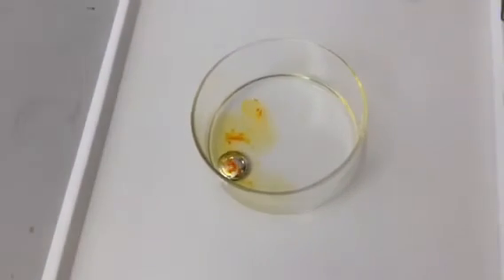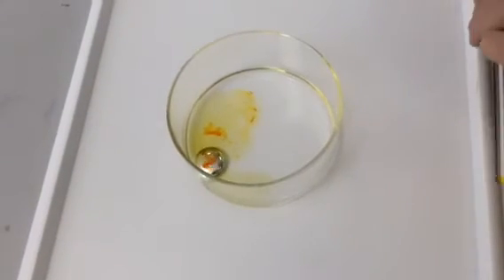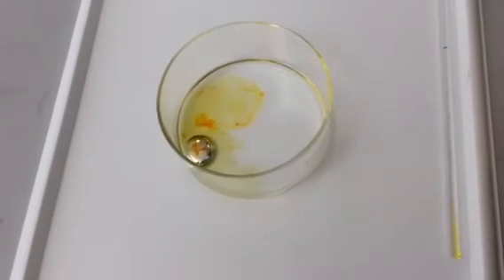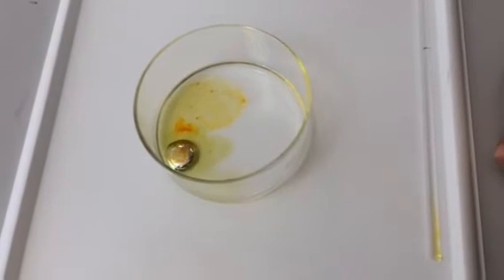It might be that the acid's too strong, but once it calms down a bit, we should see a beating heart. But at the moment it's just spinning around. Can you see it?